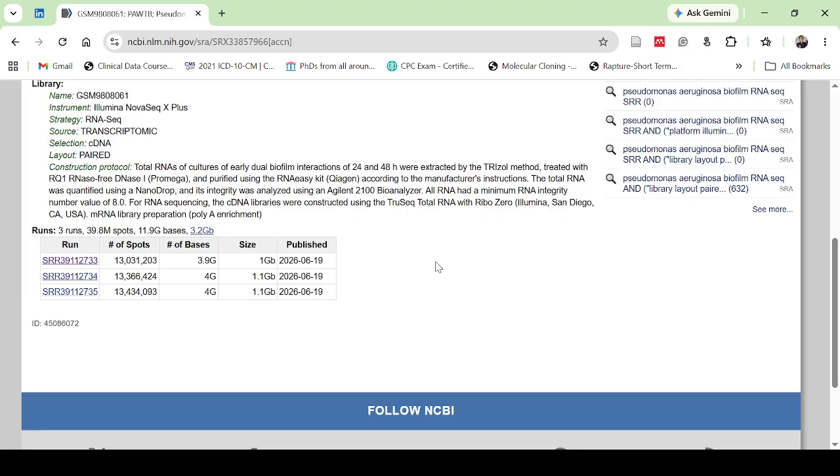Now the metadata describes the experiment in detail, and this information often includes the sample type, tissue or organism, growth conditions, collection location, sequencing platforms, etc. So always review the metadata before downloading the data, because it explains exactly how the experiment was conducted.